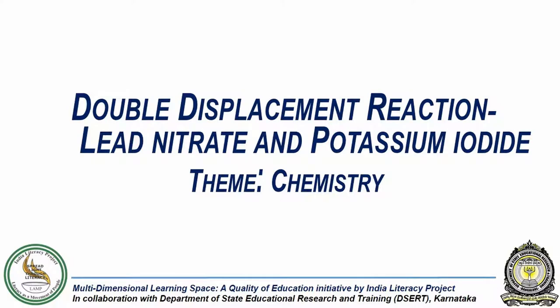In this experiment, we will study the reaction between lead nitrate and potassium iodide.